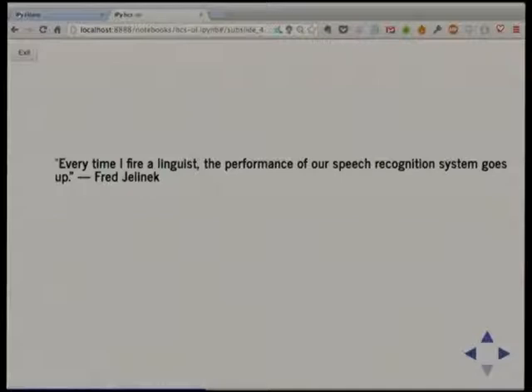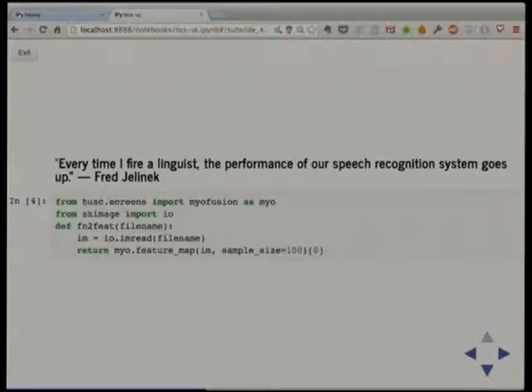And you don't need the precise knowledge, you just need to get some statistical information out of your data. So knowing this, I plowed bravely on and I did some feature mapping.